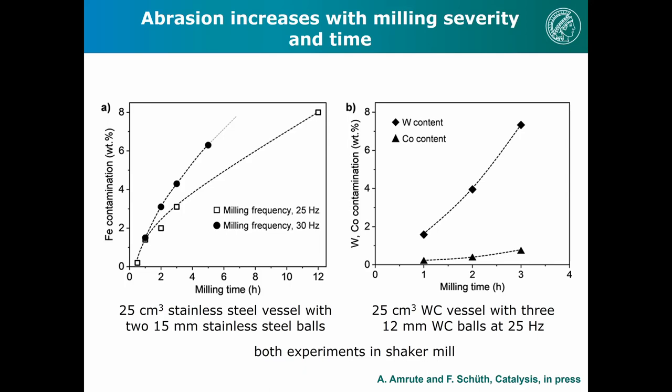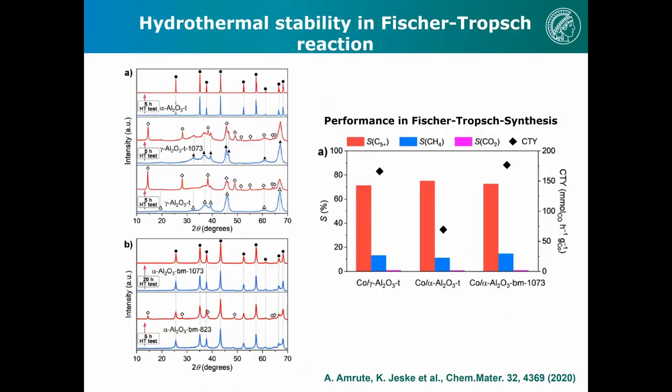If you want catalyst milling, you really don't want metallic impurities, and so then we use either corundum milling equipment, zirconium milling equipment, silicon carbide milling equipment, with foreign elements more or less innocuous. It is just that for each system you then have to optimize the milling conditions because the weight, the velocities, the impact are different. And so for different milling equipment, you have to optimize the system.